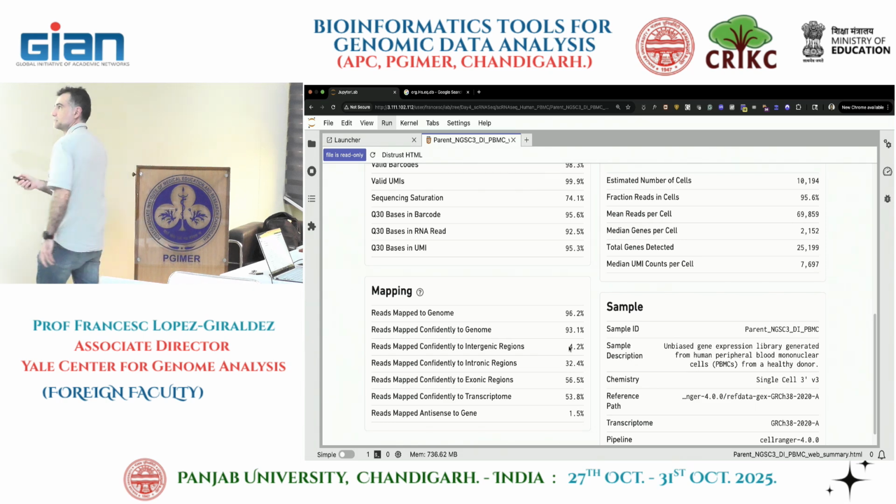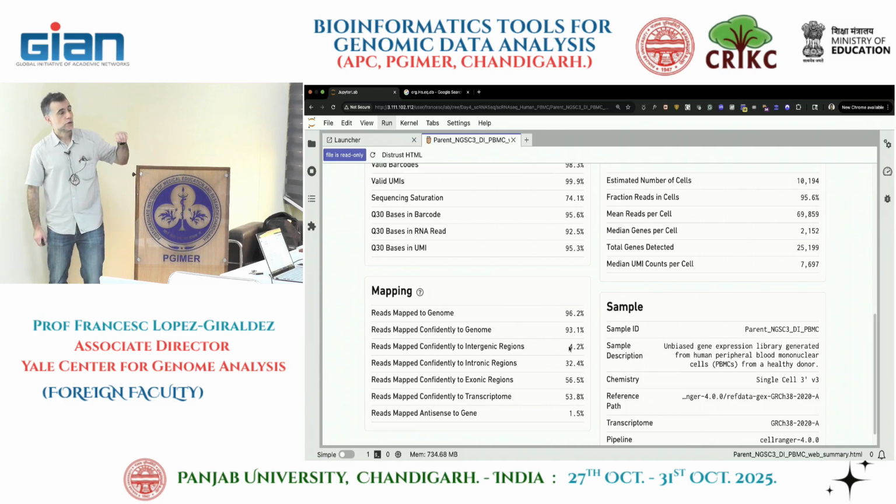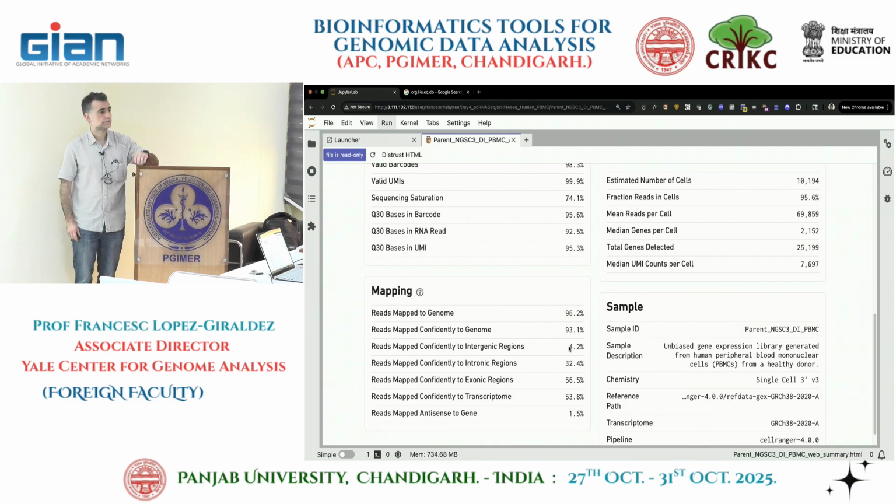I mean, all this can be important to you too, right? How do you define the cutoff? You don't define it, it's an algorithm internally that decides to create the cutoff. When it sees the drop in that plot, it says, okay, from here on, this is probably background noise.